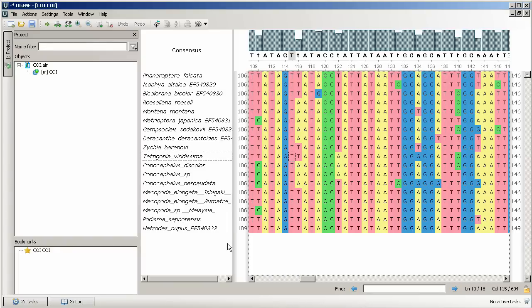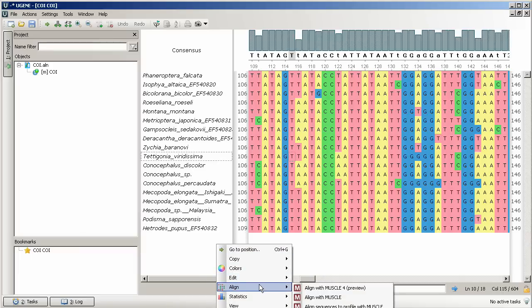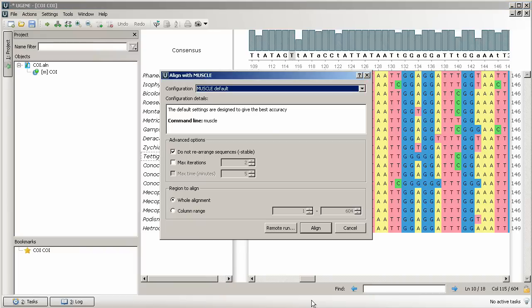Now let's finally align the open sequences with the multiple sequence comparison by widely known MUSCLE algorithm. To align the sequences with MUSCLE, bring up the context menu by right-clicking anywhere at the alignment editor area.